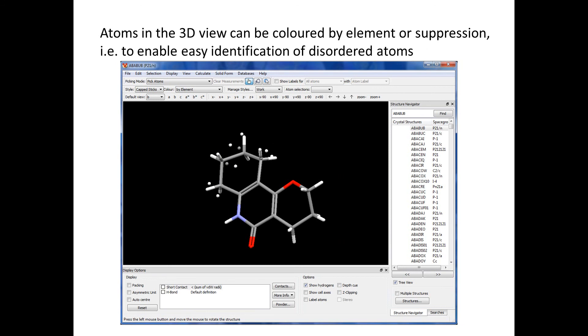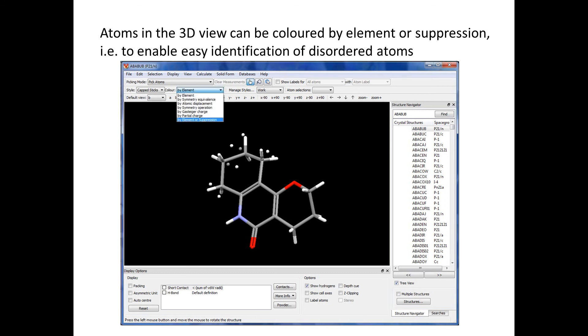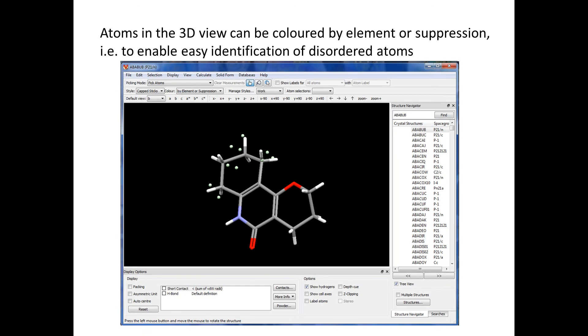Another improvement is that now atoms in the 3D view can be colored by element or suppression. So when the main menu color option is set to element or suppression, all the suppressed atoms in the 3D view are represented in the same unknown color so that they can be easily distinguished from other non-suppressed atoms. All other atoms will remain in their usual default element colors. In this particular instance, these atoms are colored as light green to show that these are the suppressed disordered atoms.